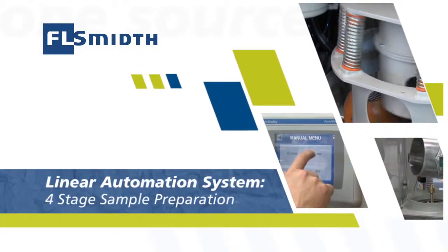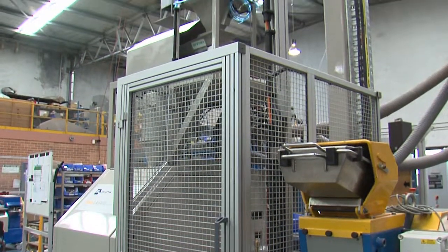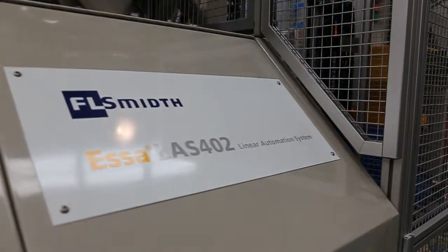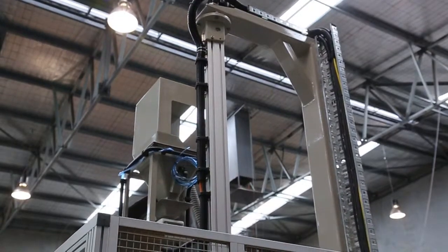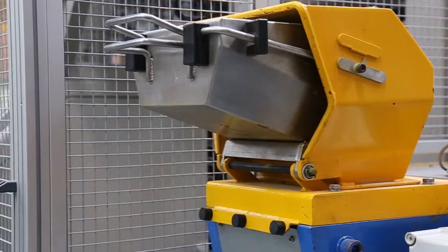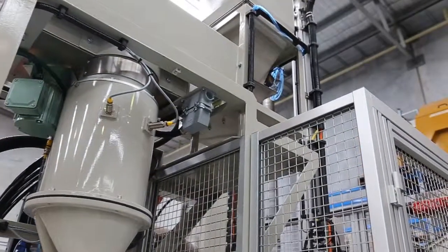FL Smith's linear automation systems link high capacity sample preparation equipment with proven mechanical sampling devices using reliable sample transfer mechanisms. Specifically designed for medium throughput mineral laboratory sample preparation, they are suited for processing mineral ores such as gold, nickel and iron ore. The system's small footprint, ease of transport and simple and fast installation makes it ideal for use in transportable laboratories and for remote mining and exploration sites.